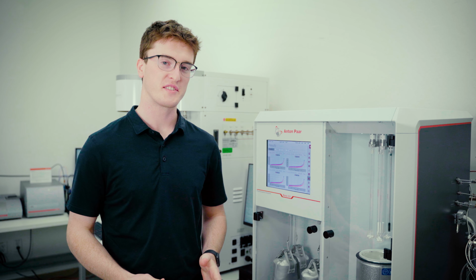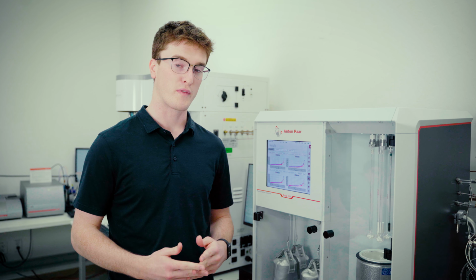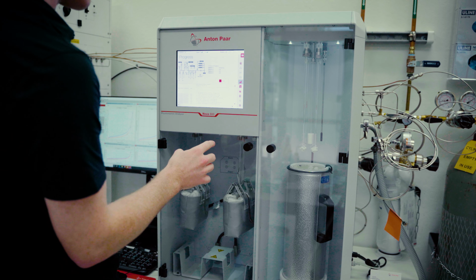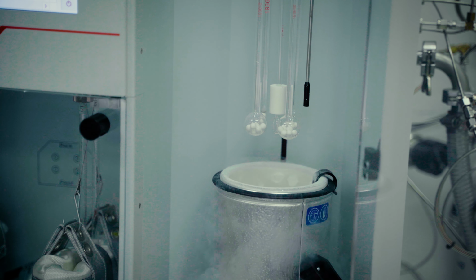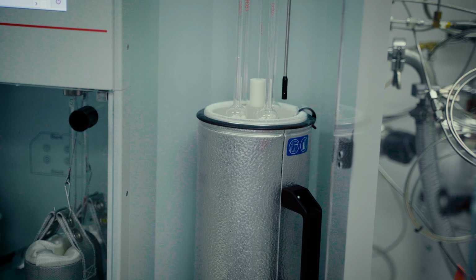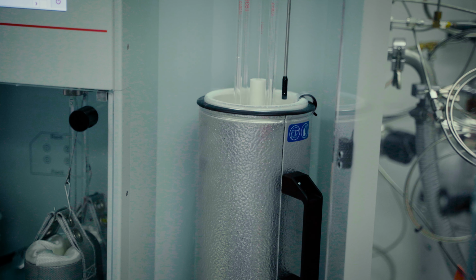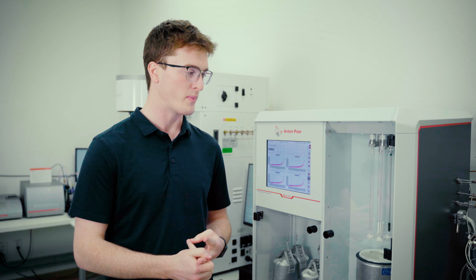For catalytic materials, some important and very standard properties to measure are the surface area and the pore structure. This instrument is our workhorse analyzer that performs these tests. This is a gas physisorption analyzer, and it can perform physisorption with various gas adsorbates at cryogenic temperatures. It can do multiple samples at once, so it's very high throughput, and it's capable of determining the surface area, pore size distribution, pore volume, and other parameters of all kinds of porous materials.